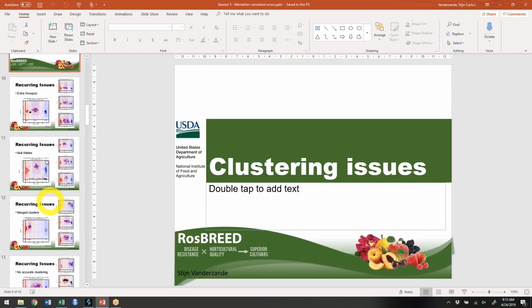And then I wanted to come back to some clustering issues. Last time I said that as we were resolving parent-child errors, you need to get a feel for it, you need to just go in and look at a lot of plots and you'll figure out what is happening. That's still true. There are so many different things I've seen. It's really hard to show everything because that would take so much time.